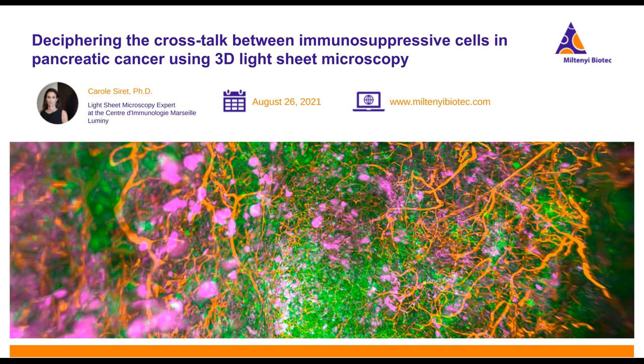Thank you. Our next question is coming in from Alejandro Lopez. It's a two-part question, and he's asking, what precautions should be considered to image a tumor in light sheet? And do you suggest a protocol for clearing and imaging in light sheet? Sorry, can you repeat the question?